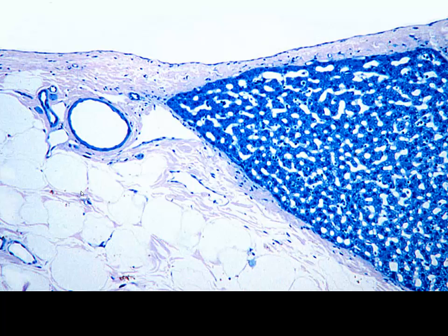So again, another view of the periphery of the liver. We can see Glisson's capsule. We can see the serosa as we move away. Here covered with the peritoneum, this would be the adventitia if this were not present. Adventitia on this side will be reaching down toward the gallbladder.